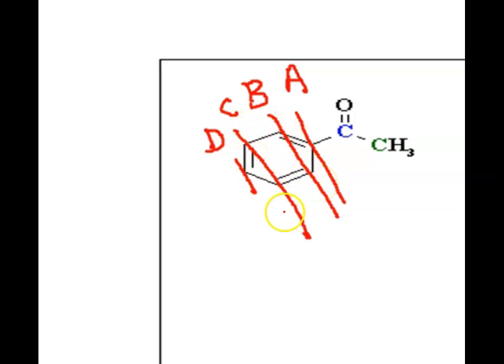That happens again with C. Now, here's how it works. Carbons that are labeled as B are actually the same proximity away from this carbonyl group, or from this A, but they don't feel the same impact as C, because those carbons here are just further away. And that's all we need to be different enough to get a separate signal on the carbon NMR.